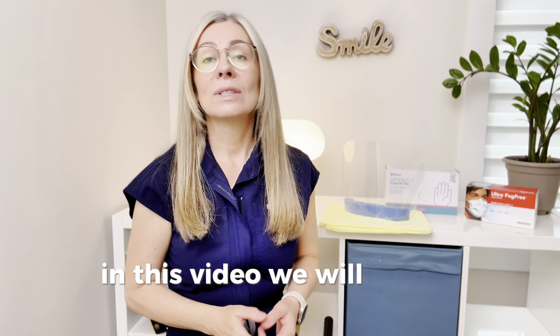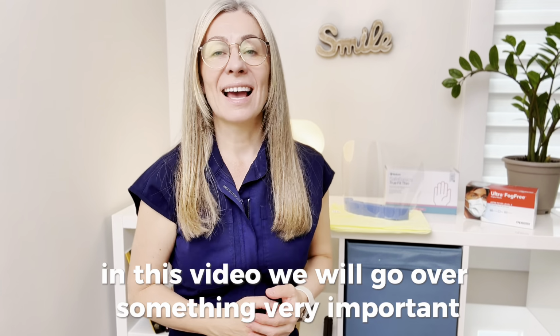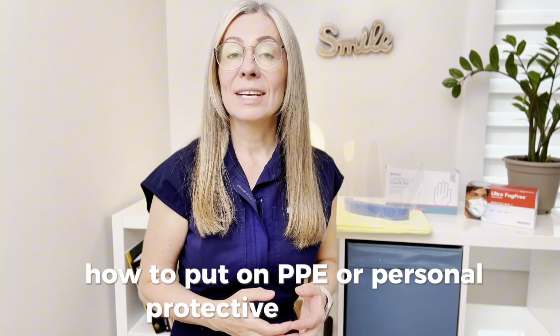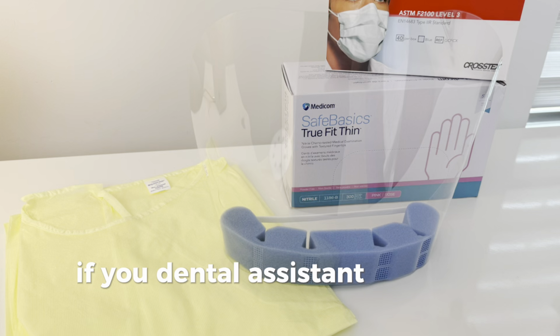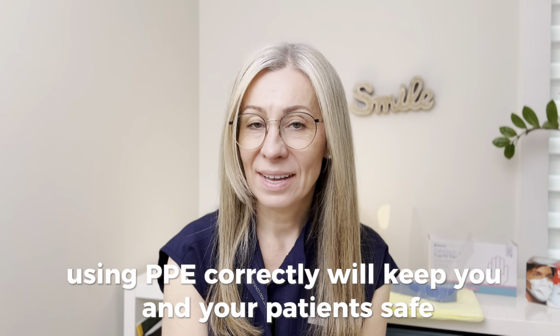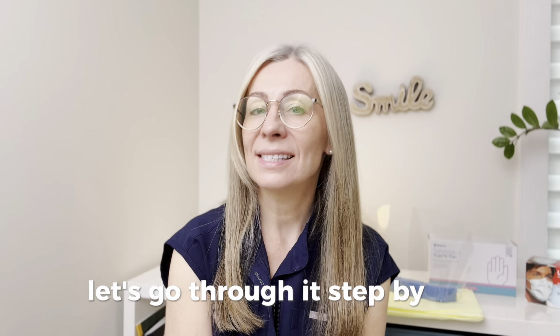In this video, we will go over something very important: how to put on PPE, or personal protective equipment. If you're a dental assistant, hygienist or dentist, using PPE the correct way will keep you and your patients safe. Let's go through it step by step.